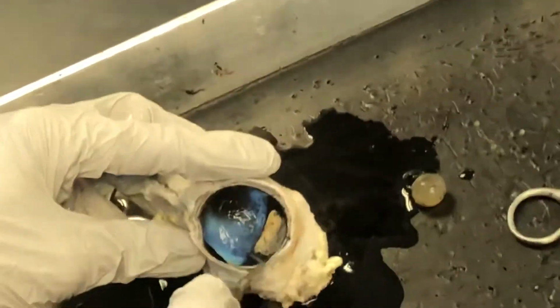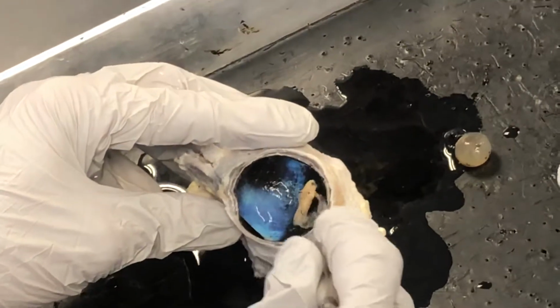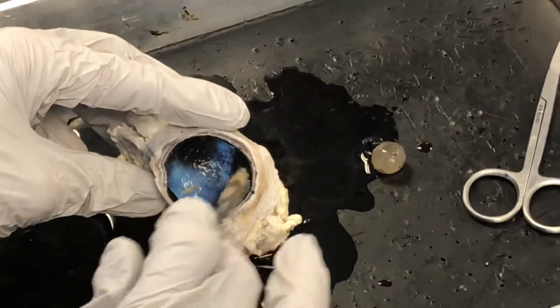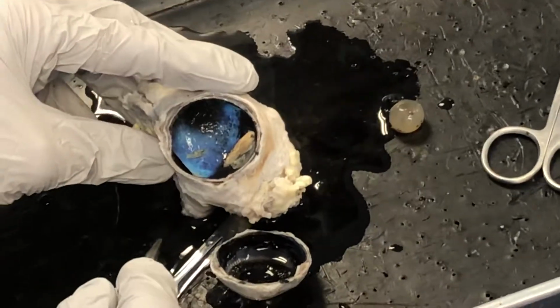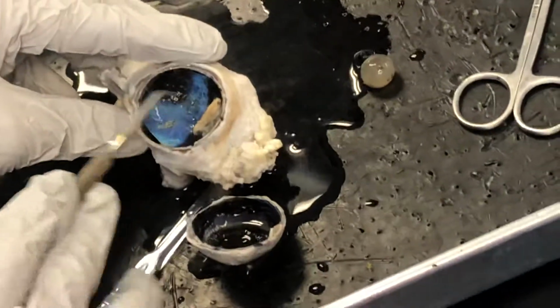So this is the retina, the stuff that looks like snot. That's the retina here. And if I tug on it, you can see where it's joined. If I tug it to the left, push it up, it's joined right there. That's where the optic nerve is, what's called the optic disc. The optic nerve leaves the rear of the eye at the optic disc, right there.